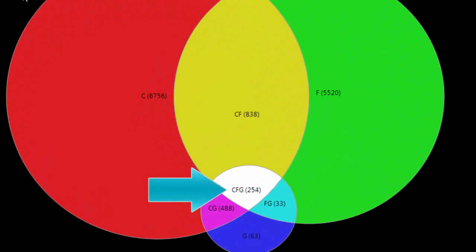For example, this section here, CFG, represents the genes that are common between all three of my selected sets.